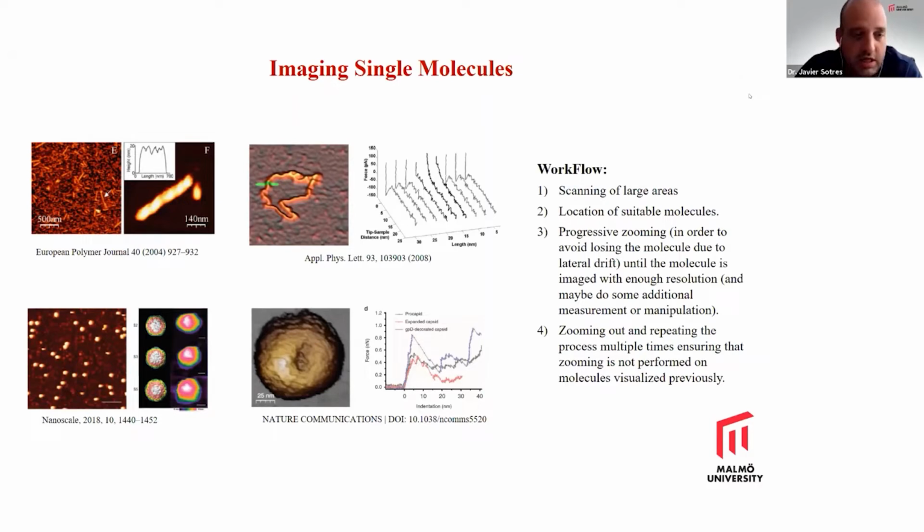So I have spent a lot of my time doing this type of experiment, and I always wanted to reduce this time. So if one wants to automate this type of experiment, what is needed? Well, the first thing is to write some kind of code that will communicate with the AFM or with the software that controls the AFM. And this is something I will not go into. It will depend on which system you are using, basically. But most commercial setups offer this possibility one way or another.